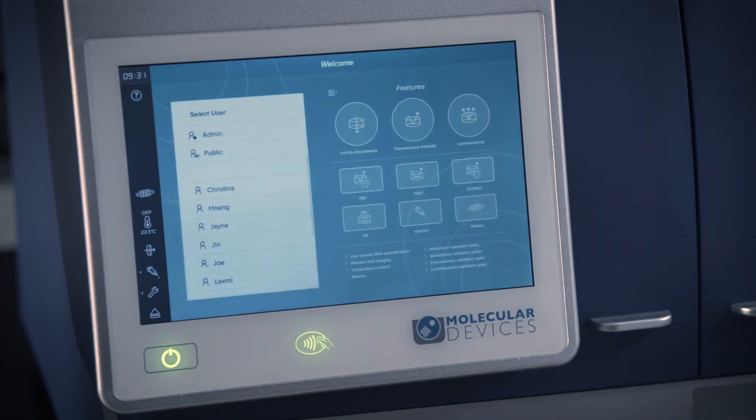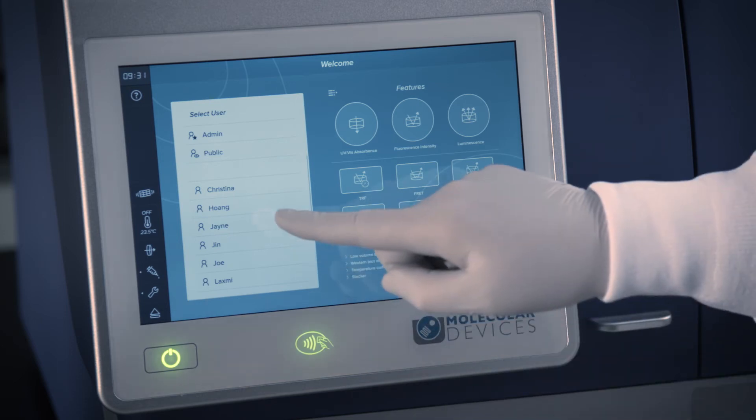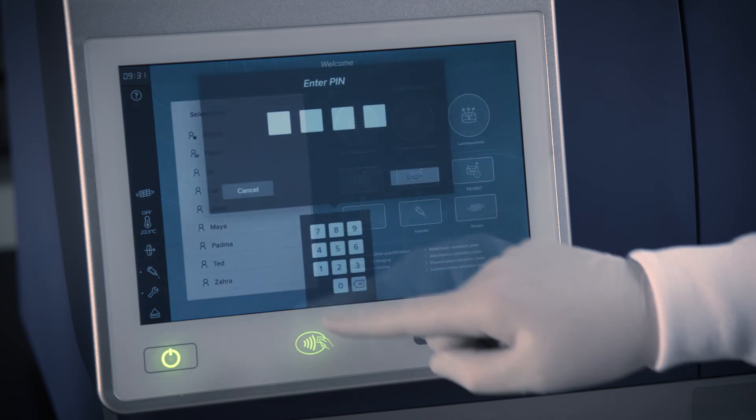If you do not have your NFC tag, you can still log in to your personalized homepage by selecting your user name and entering your PIN if it is required.